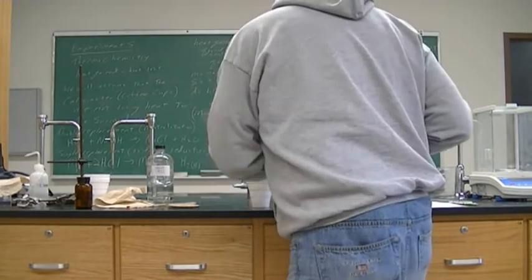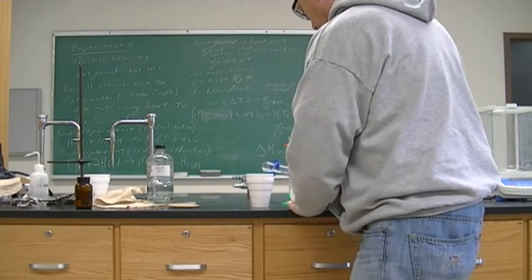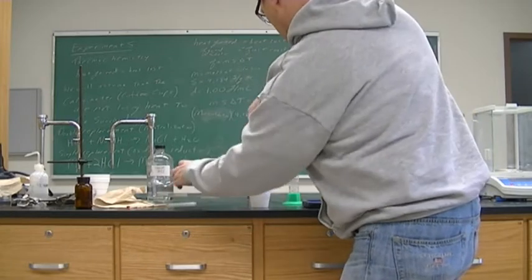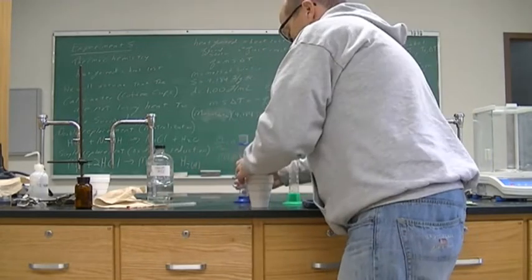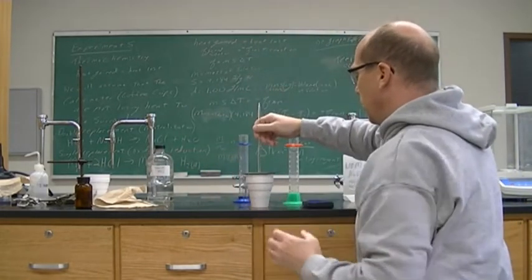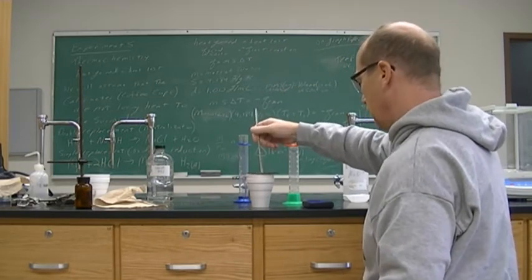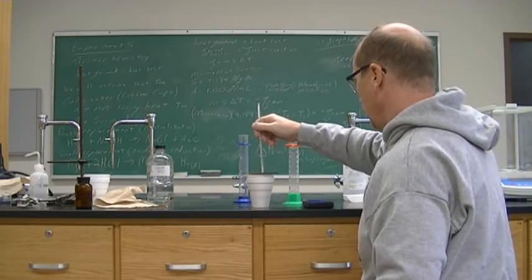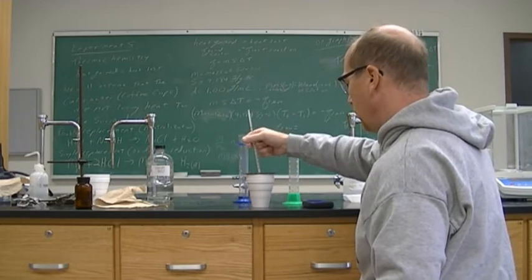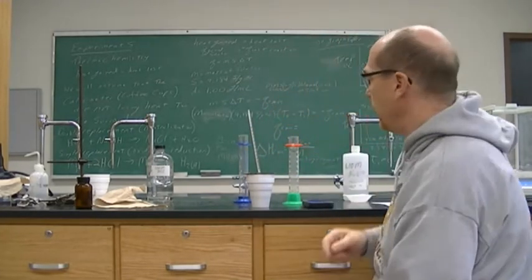Right, then once I add my HCl, I'll start my watch. Okay, starting my timer. And on my thermometer again, I started at 19. So I hear the bubbles. This reaction is generating hydrogen gas.